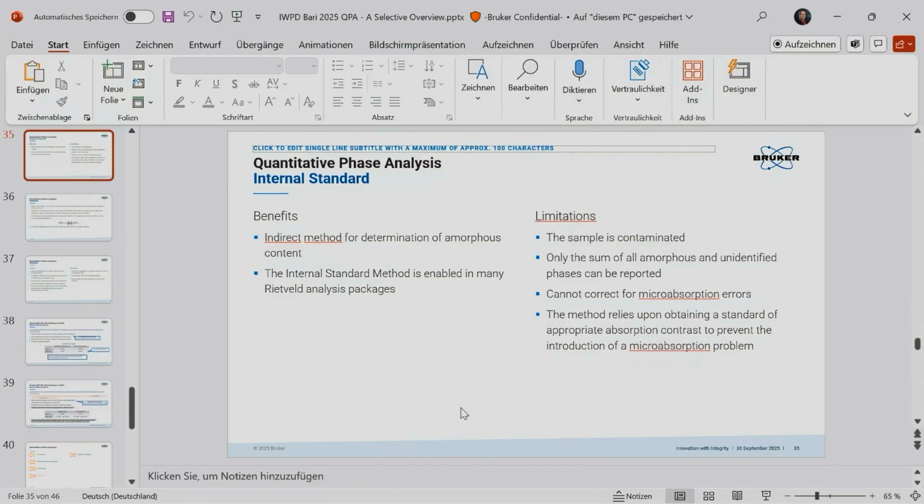But otherwise, you can use the ZMV for your non-crystalline phase, put it like this, globally for all other mixtures where the same phase is present. So you can actually build up a database where you have structured data and Pawley information altogether. Just keep in mind that the ZMV calibration factor for Pawley will change if you're using a different wavelength.